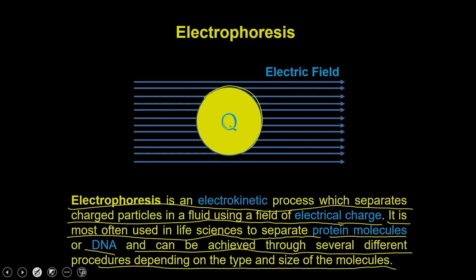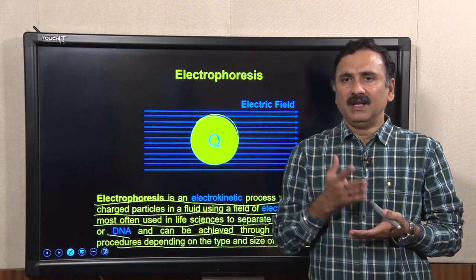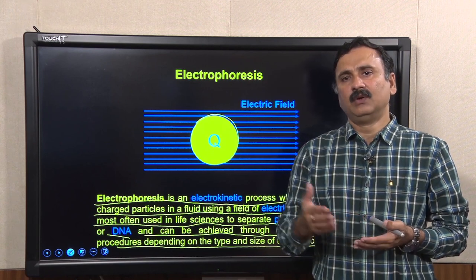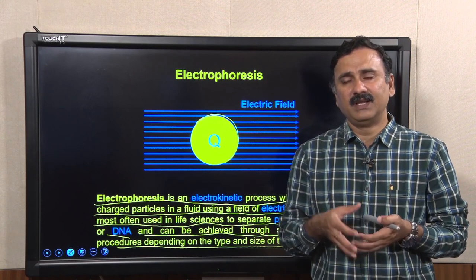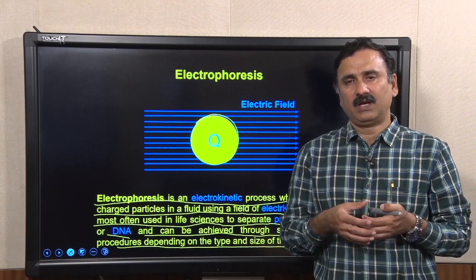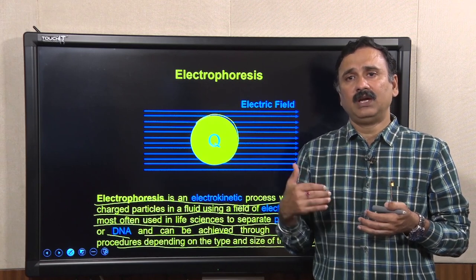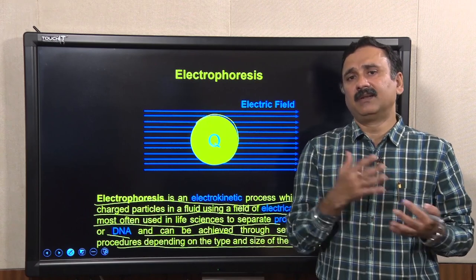Before getting into the detail of electrophoresis and how to perform it, let's first discuss the basic principle of electrophoresis, so that you will be able to understand each and every factor influencing the movement of the molecule within the electric field, and utilize those factors to bring about better separation.